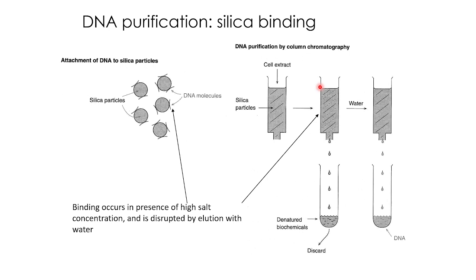So elution can be done in two conditions. One is water, one is the buffer condition. The buffer condition mostly contains some salts, which stabilize the DNA structure and allow longer storage. If you're eluting in water, it is for shorter storage, and you can use it only for a shorter period of time.